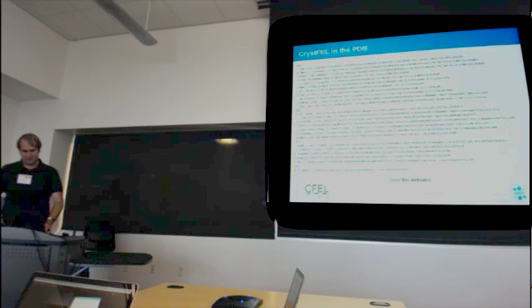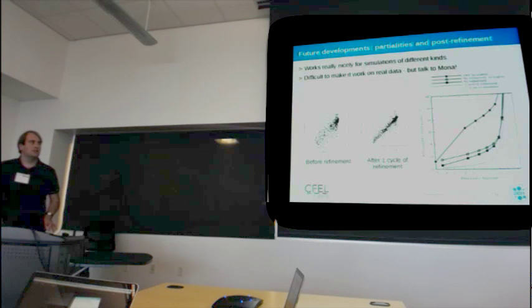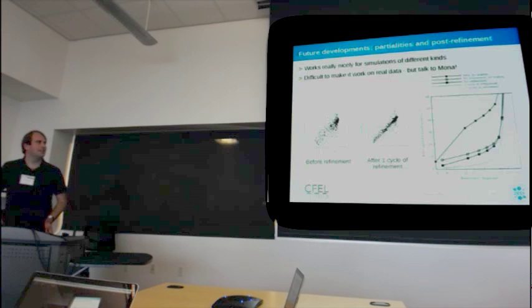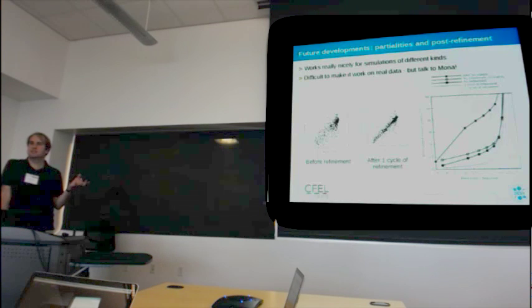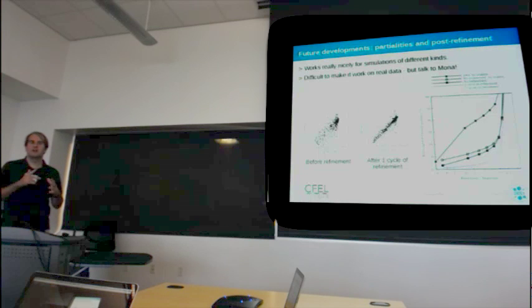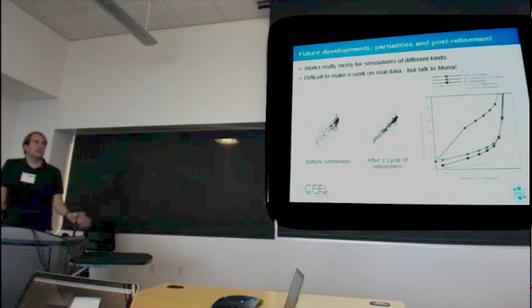This simulation result, if you read the paper for this, which of course you have, you'll see this simulation is based on calculating partial intensities and then adding noise to the unit cell basis vectors to simulate not quite knowing the initial geometry, and then to demonstrate with different levels of noise whether we can get back to the right answer. And that indeed works.